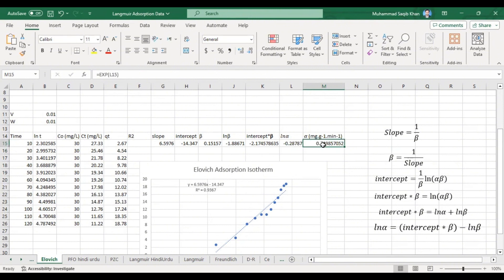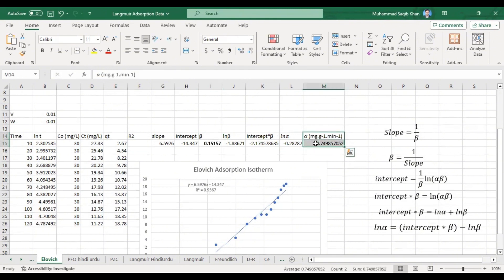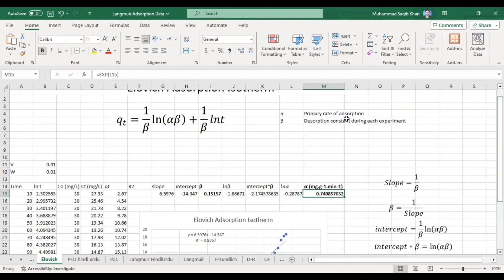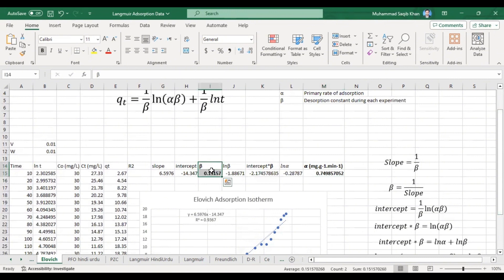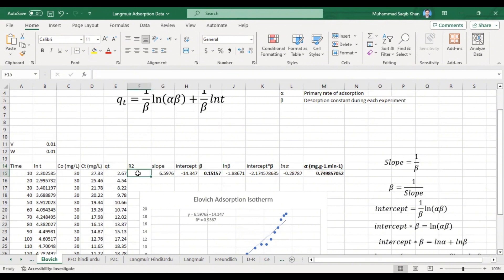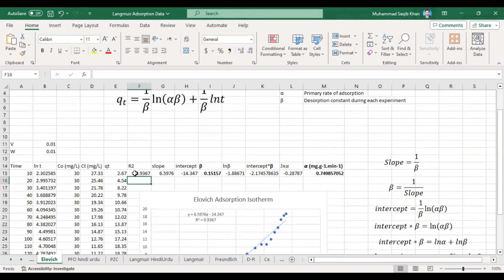Our alpha value is 0.749, which represents the initial or primary rate of adsorption according to the LOH model. Our beta value is 0.15, which is the desorption constant. The R² value is 0.9367. We used the same data previously applied for the Langmuir, Freundlich, D-R, and Tempkin isotherm models.